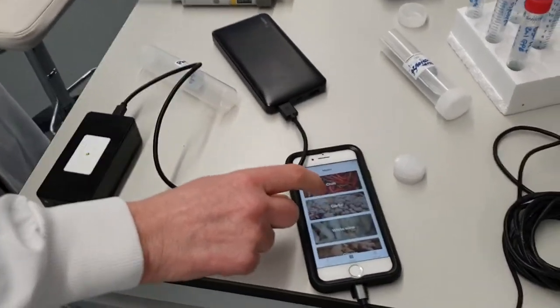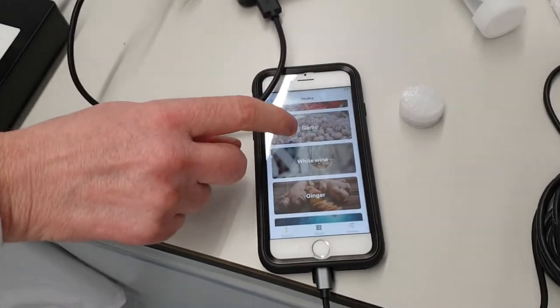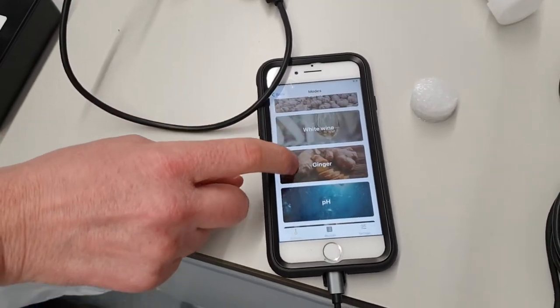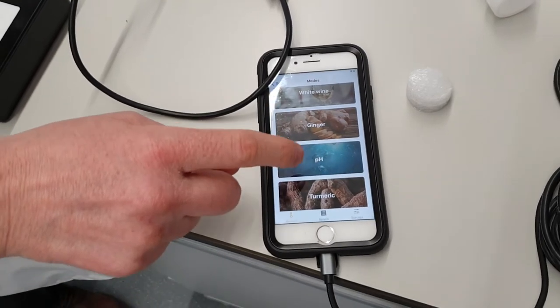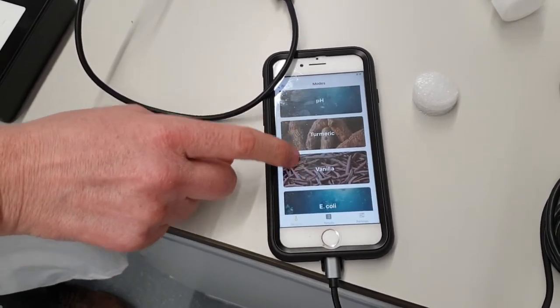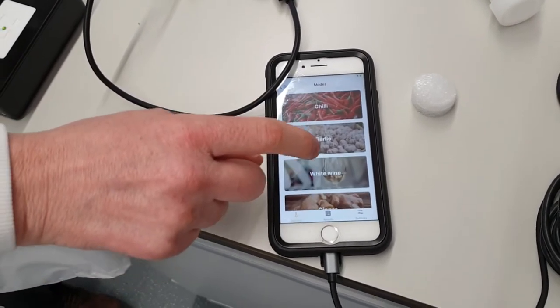Now the app allows you to measure the hotness of chili, the pungency of garlic, the sulfite in white wine, the ginger oil in ginger, the pH, turmeric, vanilla, E. coli. So we're going to test garlic.